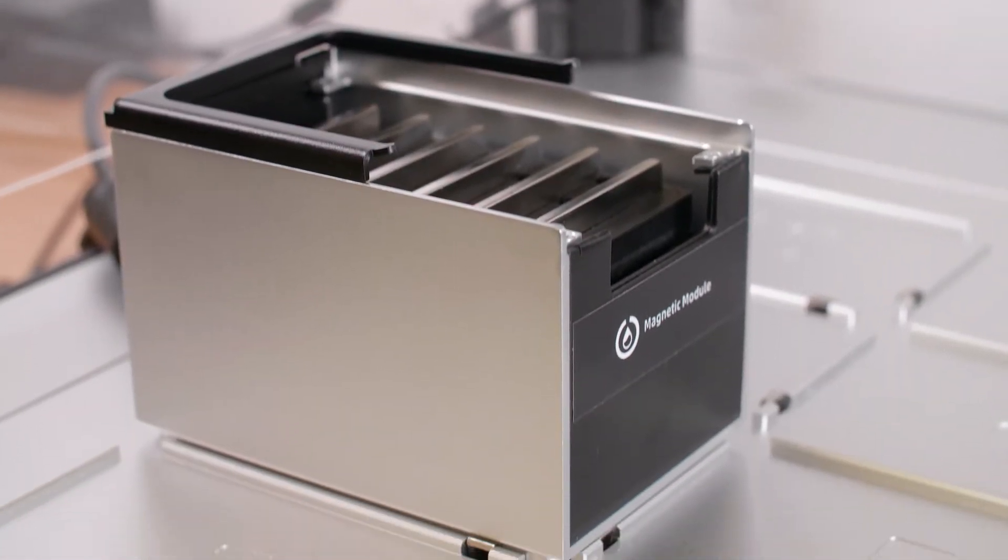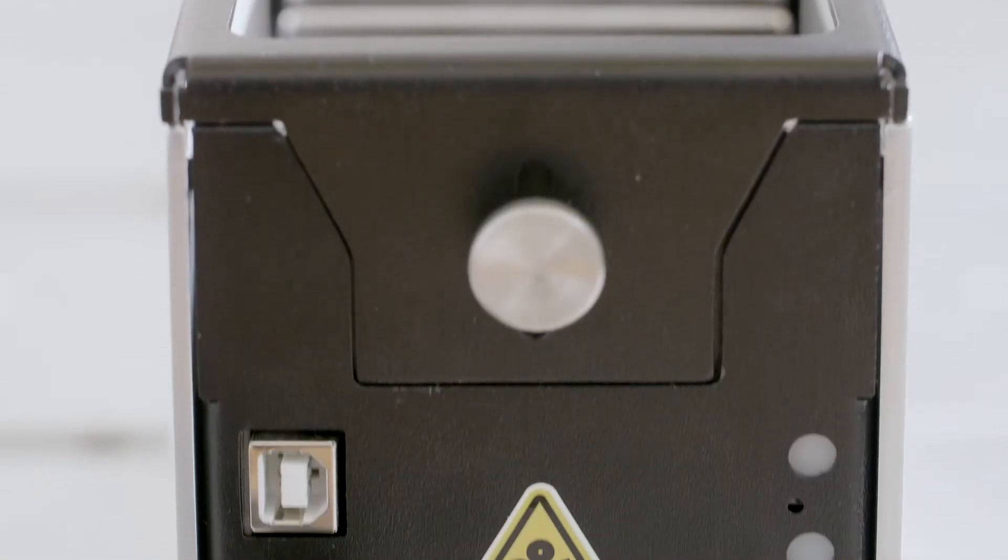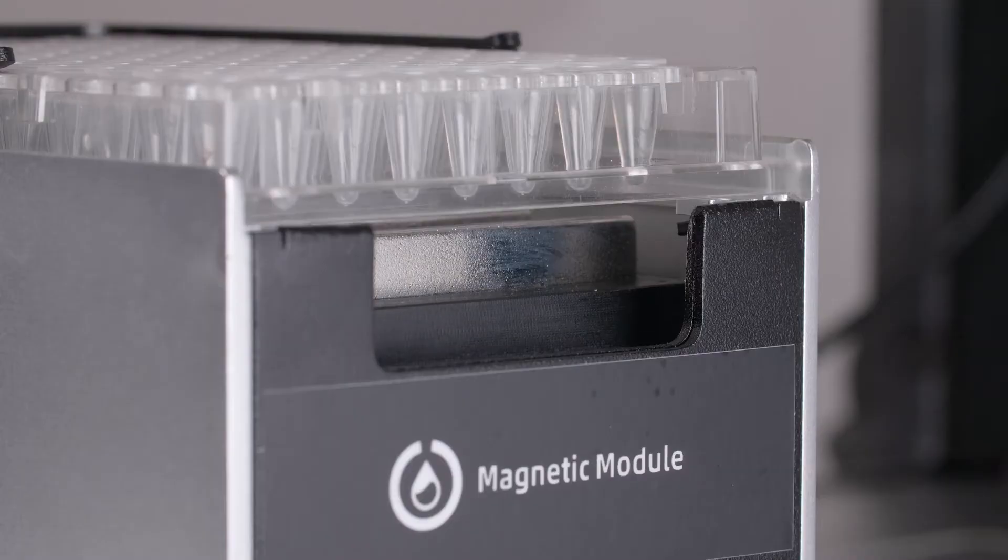This is the OT2 magnetic module. It's designed to make automating magnetic bead-based protocols simple.